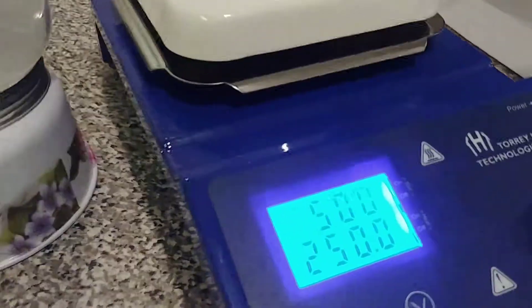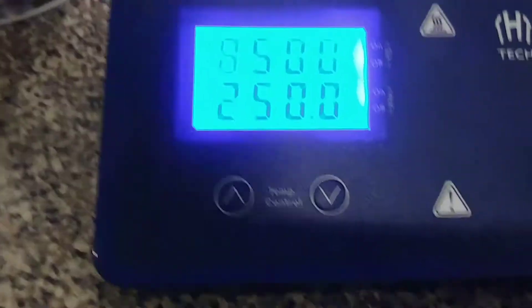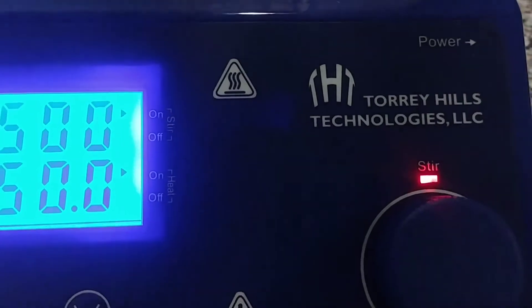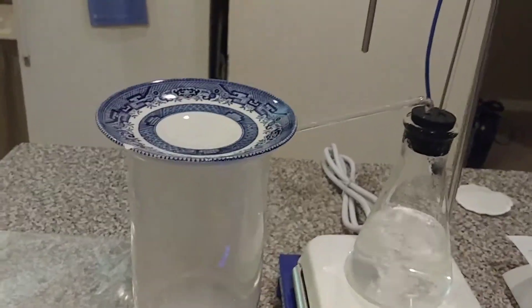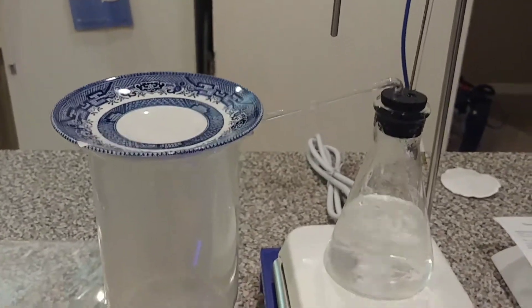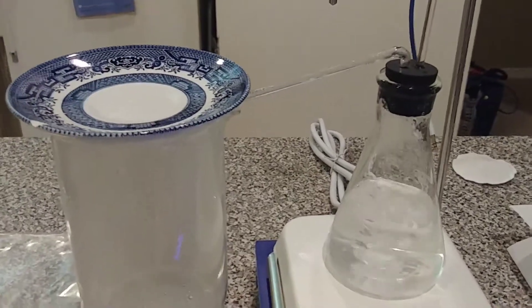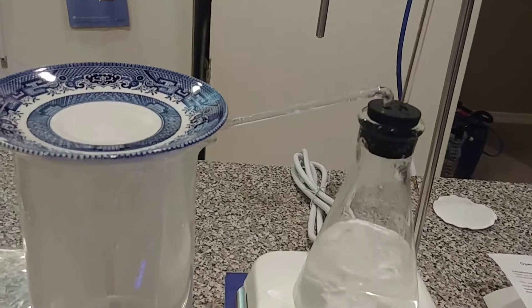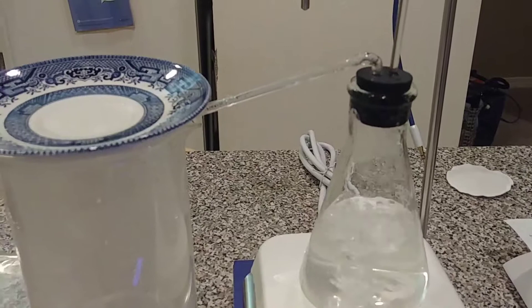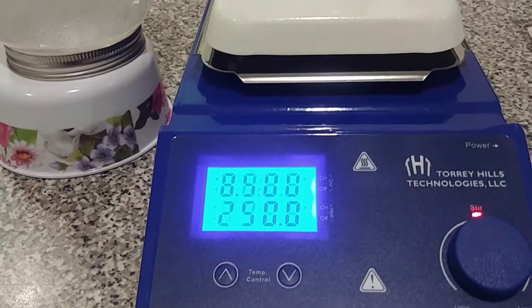I just want to show how quiet this hot plate magnetic stirrer is — barely any noise. You can see the motor running below. I got this off eBay; it's a Torrey Hills Technologies LLC. I've just been testing it out, boiling some water and distilling it.